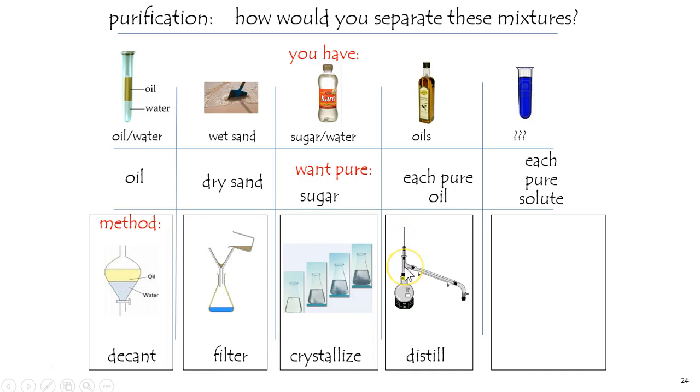It's in the gaseous phase, since after all it boiled. But you don't want to just have it evaporate, just smoke out, right? So you just have the gases exiting. So you cool that column with some cold water. That process is known as condensation, so that's a condenser. And then let each liquid drip out. Change flasks frequently here, and you have distilled off each pure liquid.